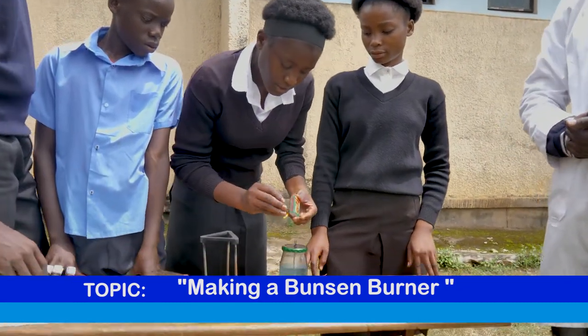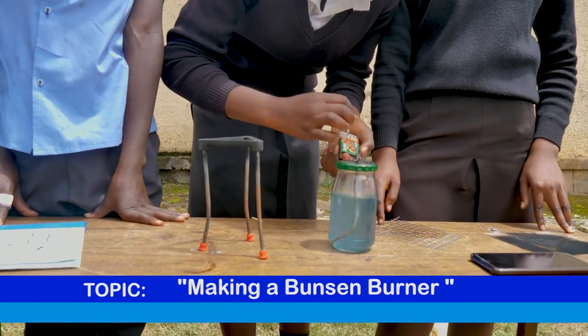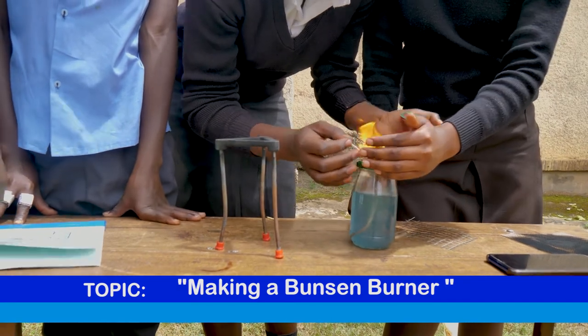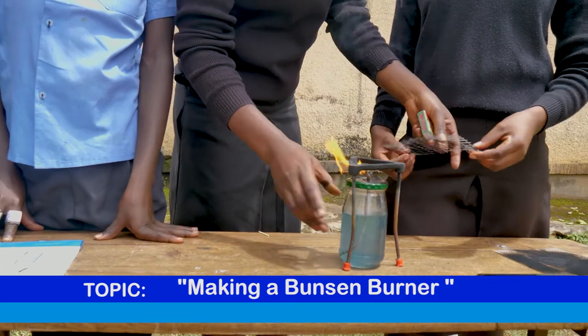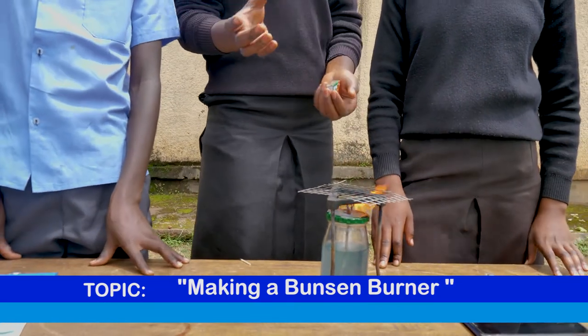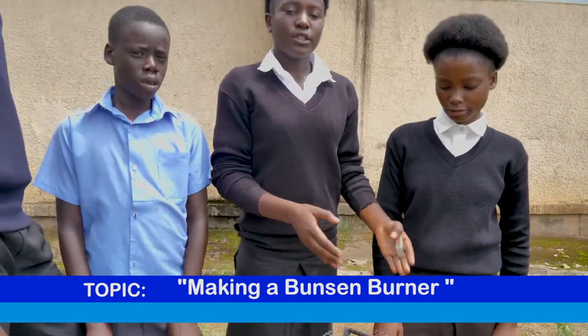How to use it — you can just turn it on with matches. As you can see it's on, and you take a tripod stand and put it on top. If you have a beaker, you can take what you want to heat and put it on top. You will be able to do what you want to do.